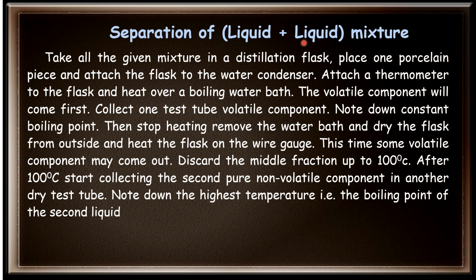Separation of liquid plus liquid mixture. Take all the given mixture in a distillation flask, place one porcelain piece and attach the flask to the water condenser.